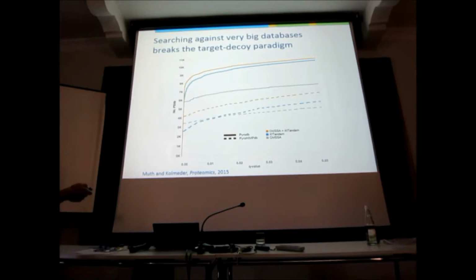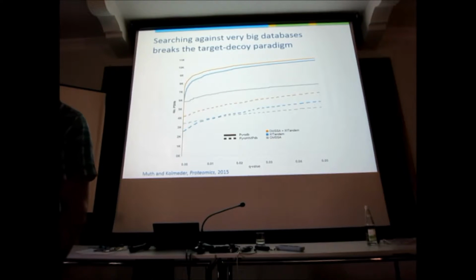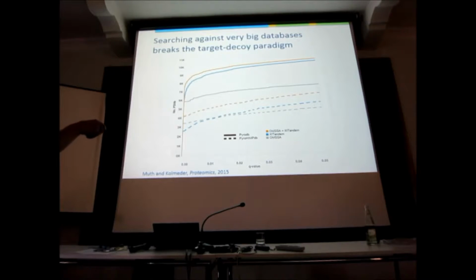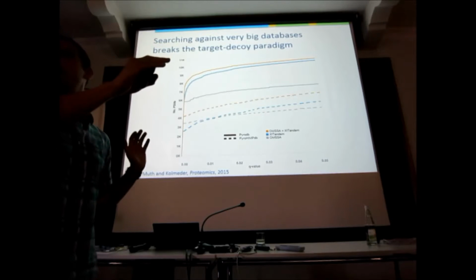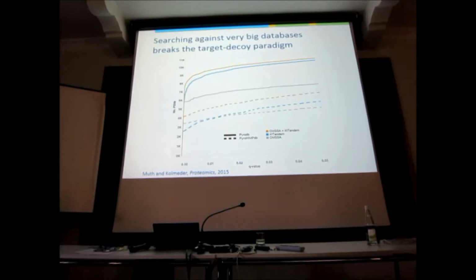And so the point is, this database is enormous, and as expected, the blue and the gray lines drop. But you notice one thing that you should have already expected. Tandem drops much more than OMSSA. In fact, Tandem and OMSSA are now cut to the same size. That's because some of the tricks that Tandem uses, unwittingly, it's not done on purpose, are now useless. Still, you do get an increase, and the increase becomes bigger than before, relatively speaking, when you use multiple search engines.